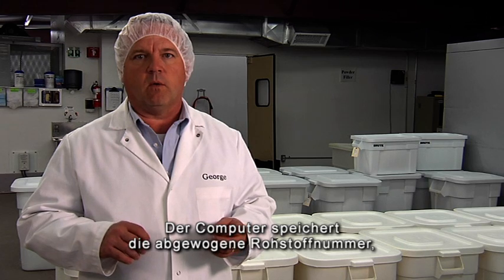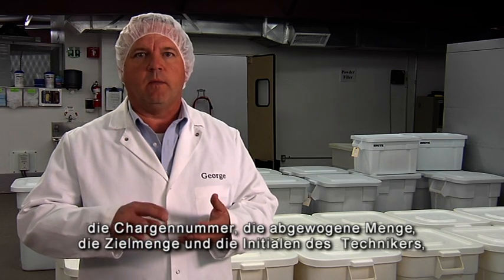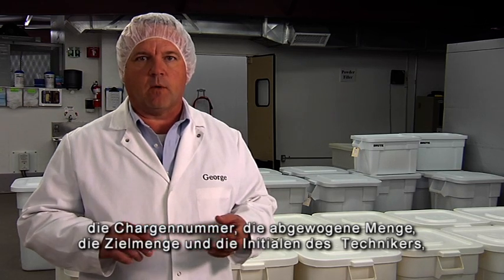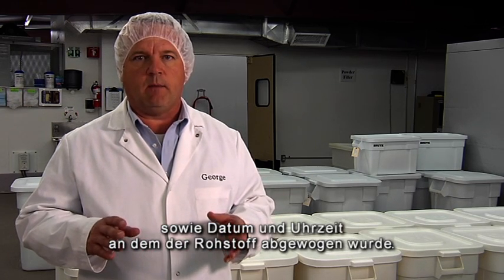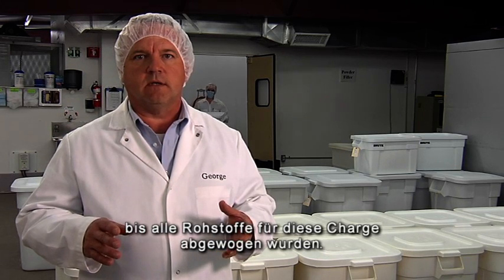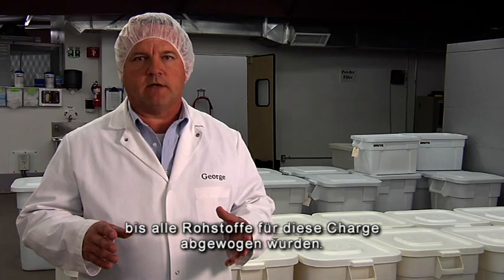The computer then records the item number that was weighed, the lot number, the exact amount weighed, the target amount, the operator's initials, and the date and time the material was weighed. The operators will continue this process until all the items for that particular batch have been weighed.